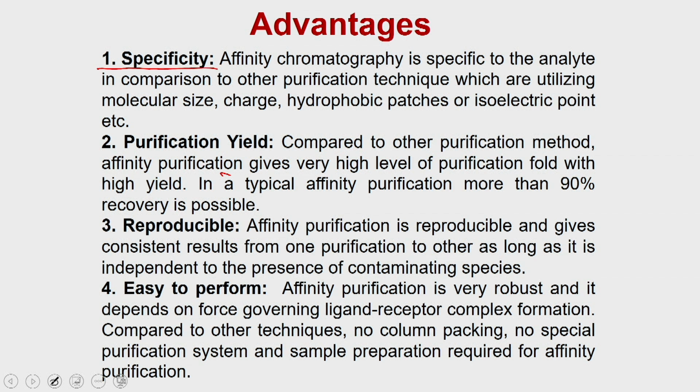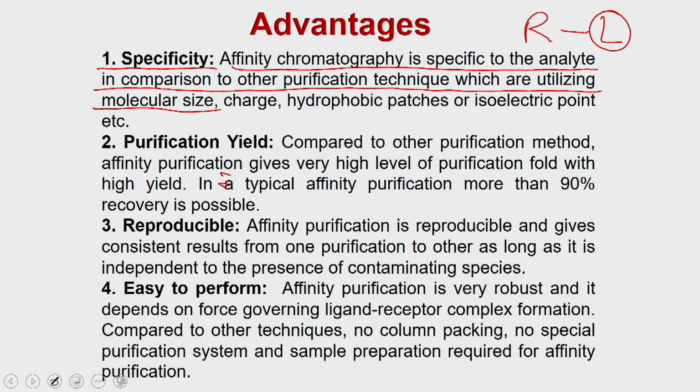As we discussed, the receptor is going to interact only with the ligand, and that is why affinity chromatography is going to be specific to the ligand or the receptor you are using, in comparison to other purification techniques which utilize either the molecular size, as in the case of gel filtration, or the charge, as in the case of ion exchange chromatography, or hydrophobic patches, as in the case of hydrophobic interaction chromatography, or isoelectric point, as in the case of isoelectric focusing.